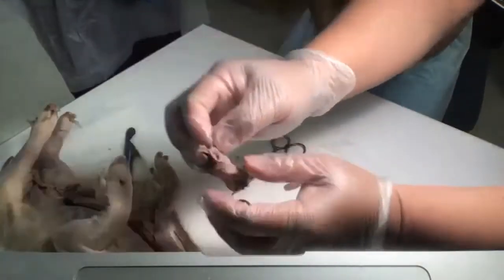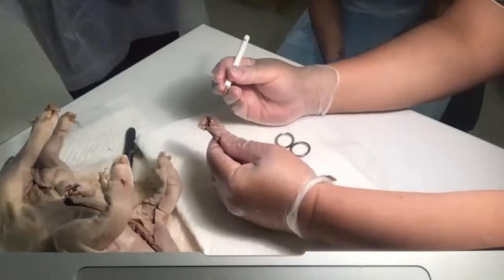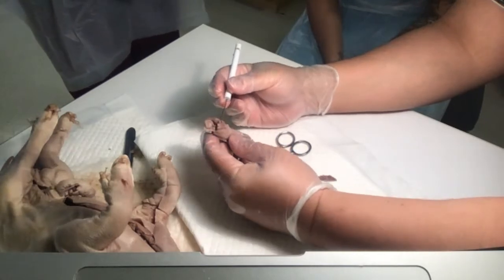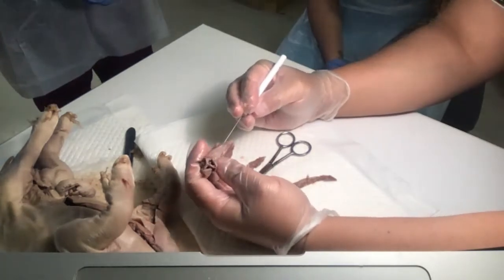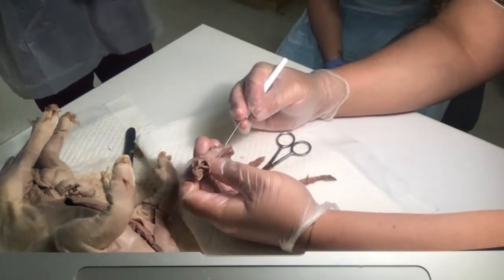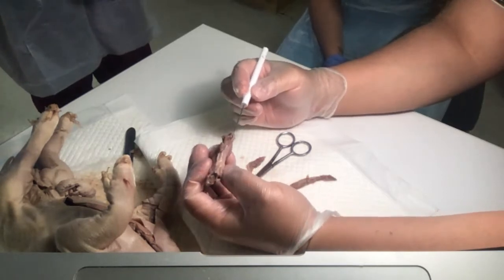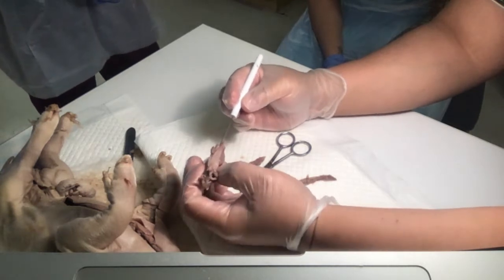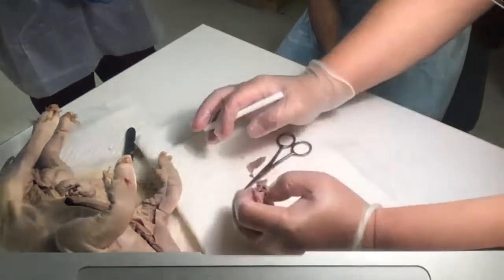You see here? See that little... well, where's my probe? Everyone see here that this is a little flap. This little flap, that's your epiglottis. And if we look here, we have one thing that's here, that's in the front, but can we see that the hole is big and it's open? But then if I look at this hole, it's flat. So this is anterior, this is posterior. And the anterior part, that's your trachea.